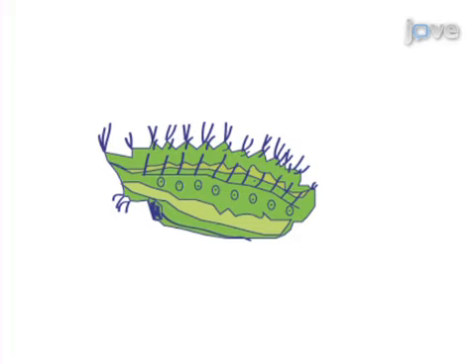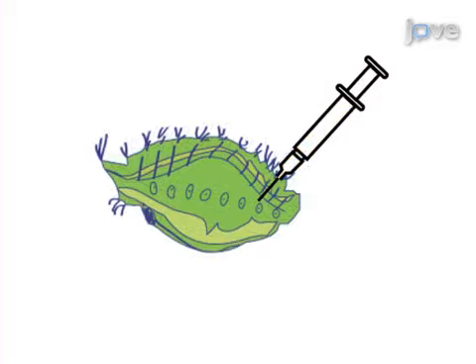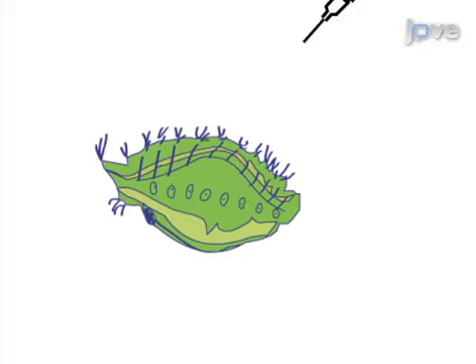This is accomplished by first anesthetizing the caterpillar by placing it on ice, injecting it with a buffer solution containing an anticoagulant, and returning the caterpillar to the ice to allow the hemocytes to re-enter circulation before extraction.